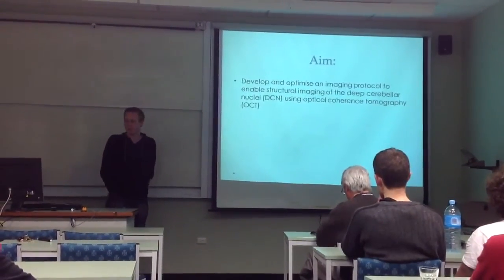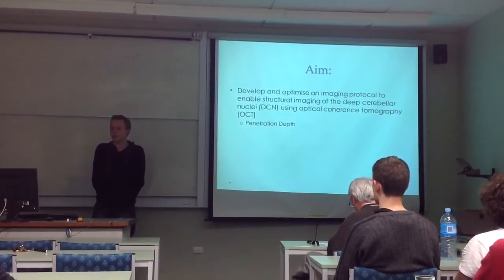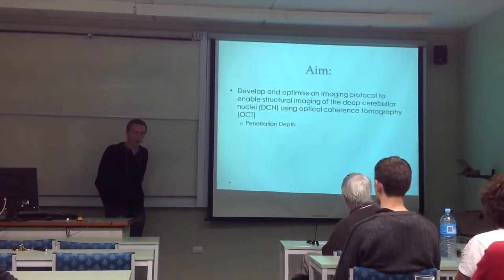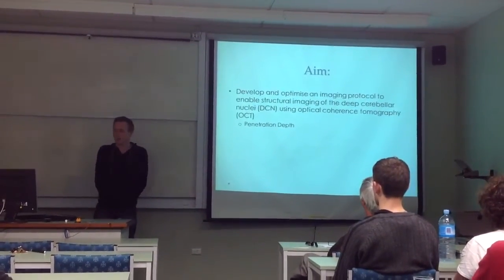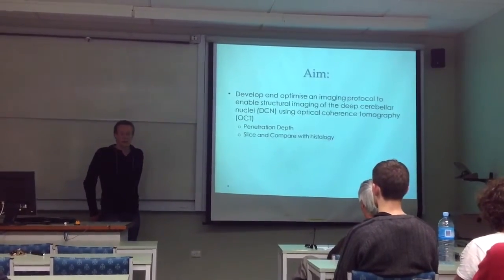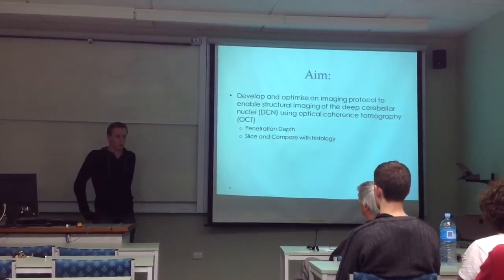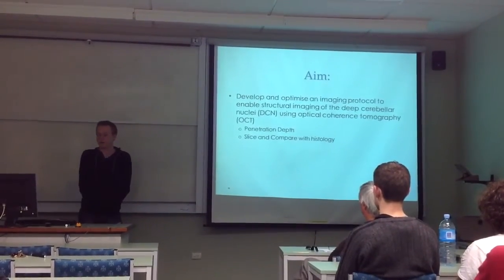I broke my project up into sort of 3 little chunks. I first needed to evaluate whether OCT had the penetration depth required to reach the DCN, as it is deep within the cerebellum. Then I sliced the cerebellum up to try and get more structural information out, and then I'm going to compare that with already known data.